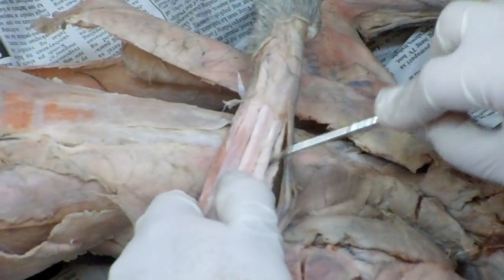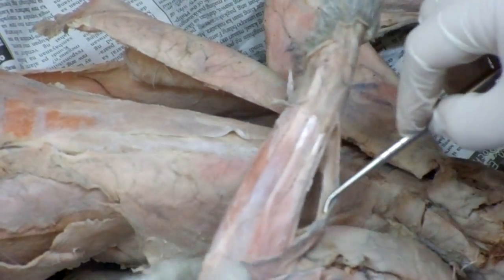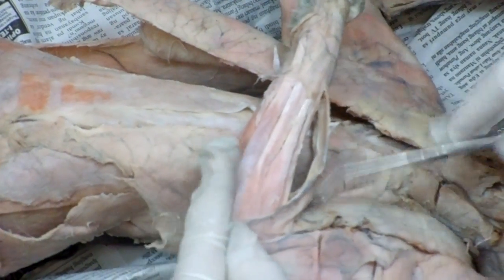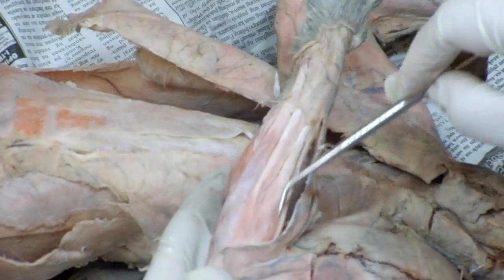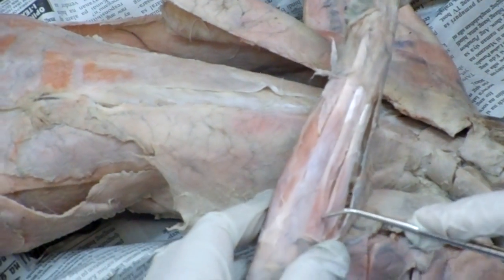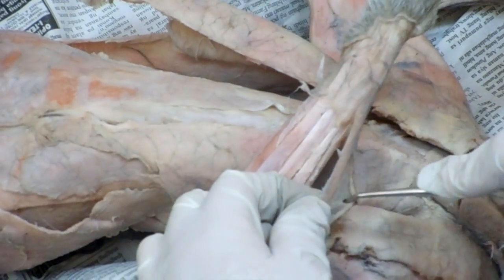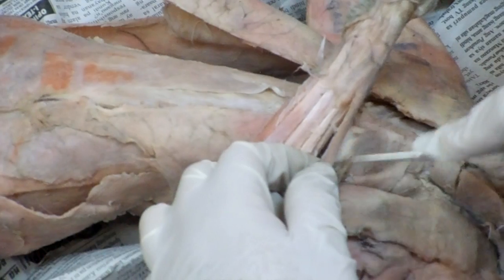Brachioradialis or supinator longus. Next to the preceding on the preaxial border of the forearm. It is loose and stands away. Take note, loose muscle, and it stands away from the underneath extensor. Origin: middle of the humerus. Insertion: lower end of radius and adjacent ligaments.